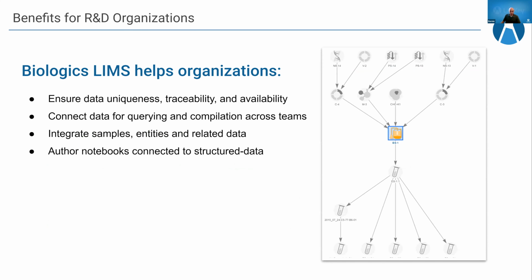All right. So when you do get our Biologics LIMS implemented, there are many significant benefits, some of which are clear at the surface, and as I mentioned on the previous slide, others are deeper and more systemic.